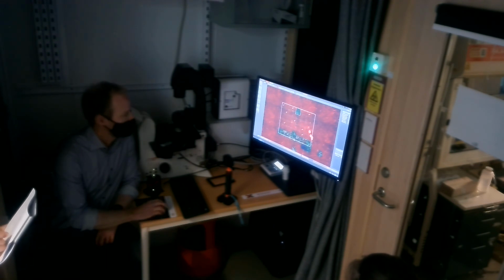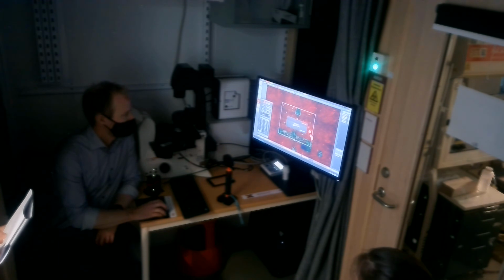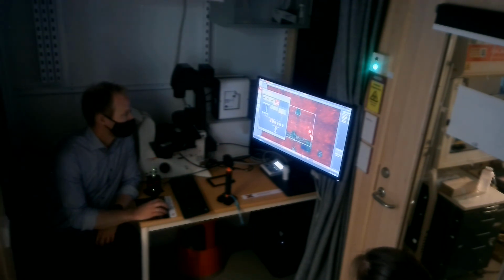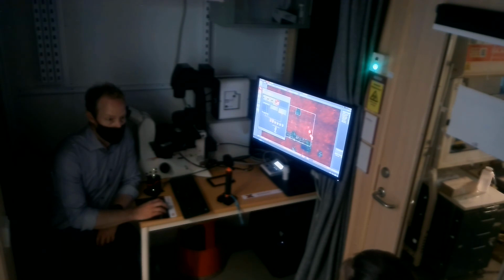Any questions? Can we in theory also do the autofocus in bright field? Yes, you would just have the bright field channel, and if bright field is the first one, then it's going to do an autofocus job on the bright field. Does it make sense to do the autofocus in bright field?